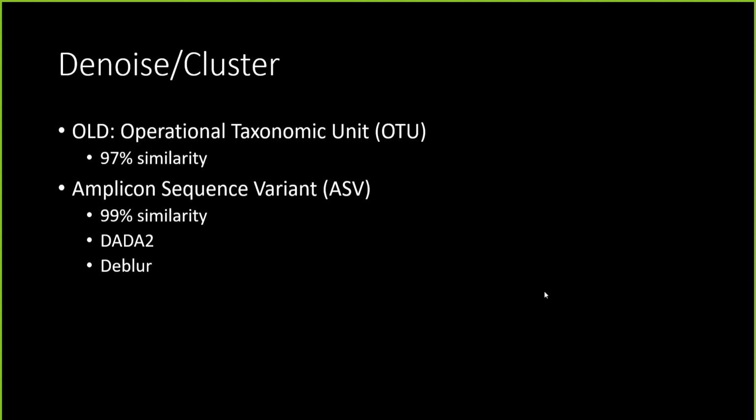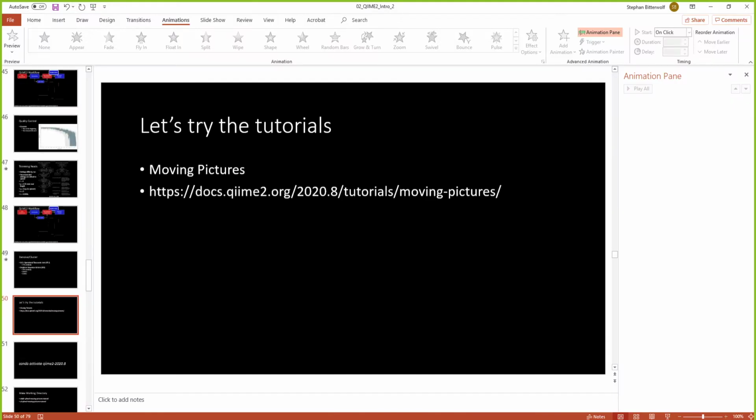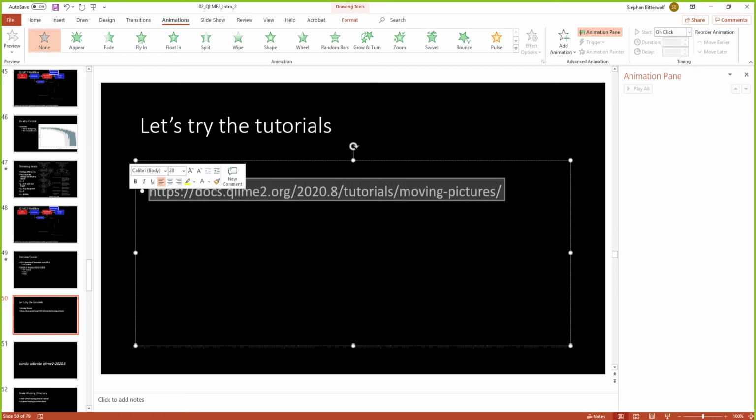So, what time do we have? We've got 3:33, so we can actually go through the moving pictures tutorial if you guys would like. I think that would be a good use of time. So feel free to follow along by actually going to this page that I've got on the slide here. I'll put this in the chat.